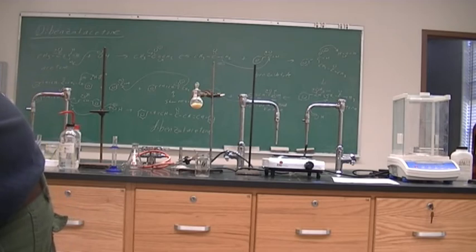We're at 70, no melting. We're at 80, no melting. We're at 90, no melting. We are at 100, no melting.